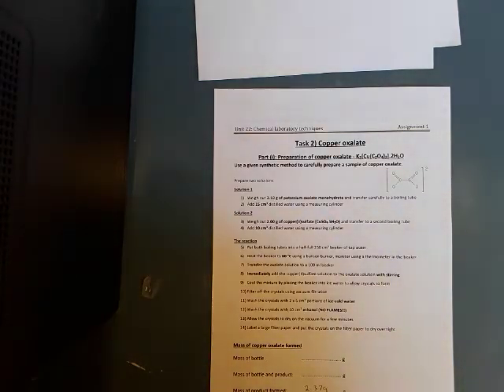Okay, it's time for our last installment, synthesis of copper oxalate. So again, I'm going to go through the method, picking out just a few as to why we would do them, problems associated, and also improvements as well.